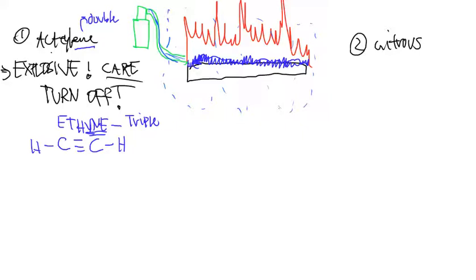So a lot of people think that acetylene has two carbons that are connected by two bonds, not by three. And the reason is because they're thrown off with the ENE ending. It's just a common name that we use and it confuses people, and I'm sorry that it does, but this is just the accepted name that was given to the gas back in the day. So that's one type of tank that we have on the AA instrument.